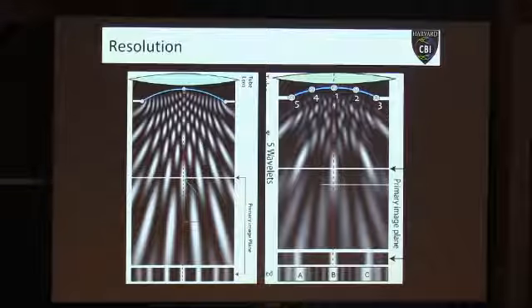And so if we just have 3 wavelets, this is kind of like doing a triple slit experiment. So here's our tube lens. This is what's happening behind our tube lens, where we're taking plane waves, converting them into spherical converging waves. And those spherical converging waves are all interfering with one another. So if we have 3 of these coming in, you can see this pattern gets a little more complex.